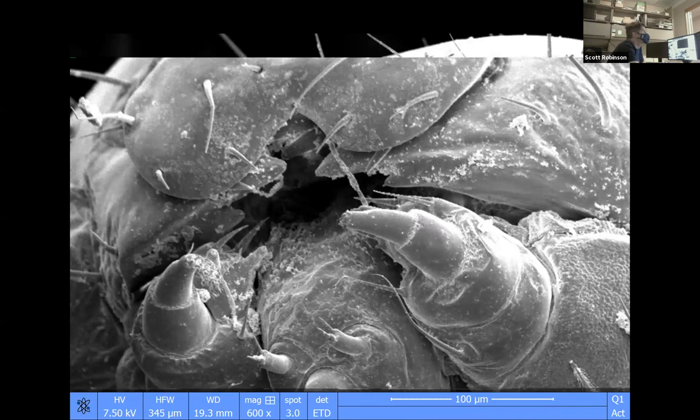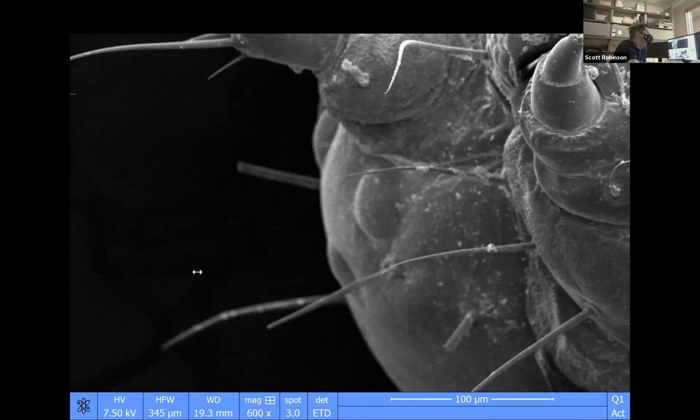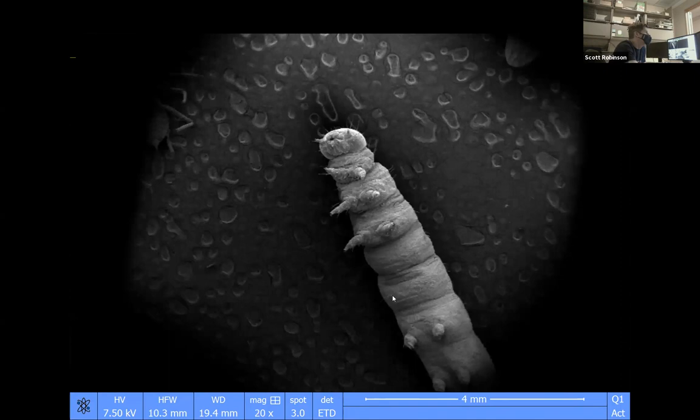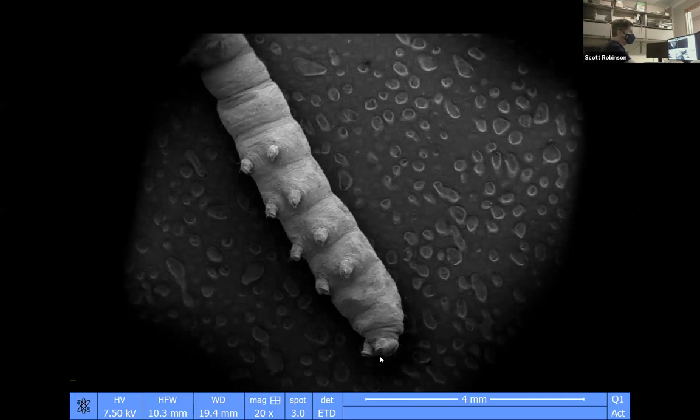Sorry, it's so dirty. And then we can see some other little palps on here. We can see some of the eyes on the other side of the head right here, just those little dome-like things that are facing sideways. And then we can show you that it really does look like a caterpillar. And you can see its little arms or legs, and then we can see its prolegs, and then we can see its tail.